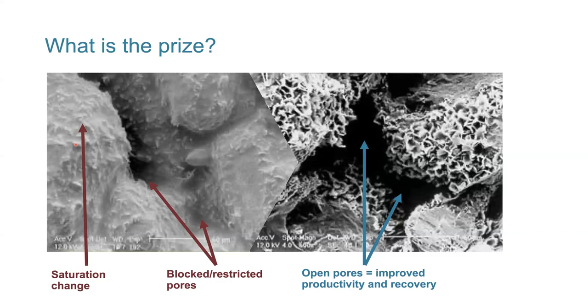And when we went and looked inside the core sample, we could see what had happened was the saturation had actually increased. So the saturation to native brine was lower than the saturation to the introduced potassium chloride, I think it was in this case, completion brine. So this was a fluid filtrate retention, saturation change issue. And as soon as you see that, you can start to understand, okay, there's a big problem here because the fluid is trapped. But because now we know it's an aqueous fluid issue, we can start to look at solutions. So you can start to say, can we look at a surfactant or a treatment fluid to break the surface tension and remove this fluid? Or can we change to a different chemistry that this won't happen with?